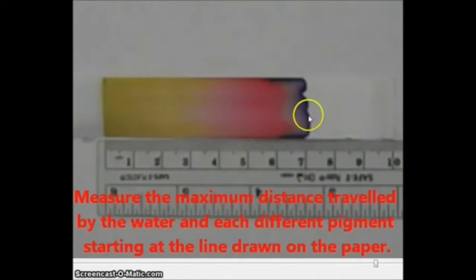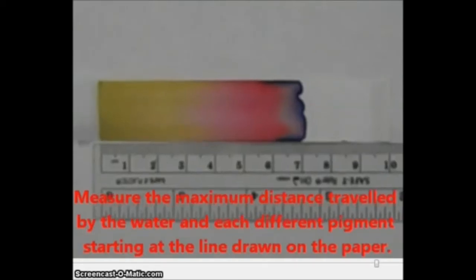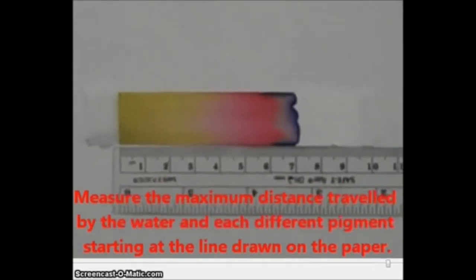Looks like the maximum distance traveled by the water reaches about to here, and then we can measure the maximum distance traveled by each of the different pigments. Let's continue our playback.